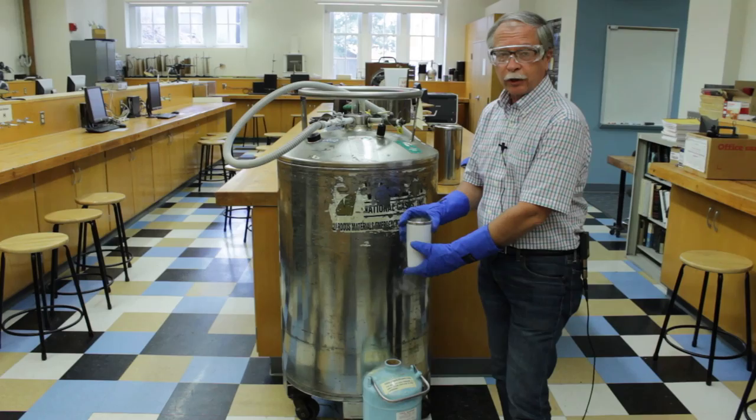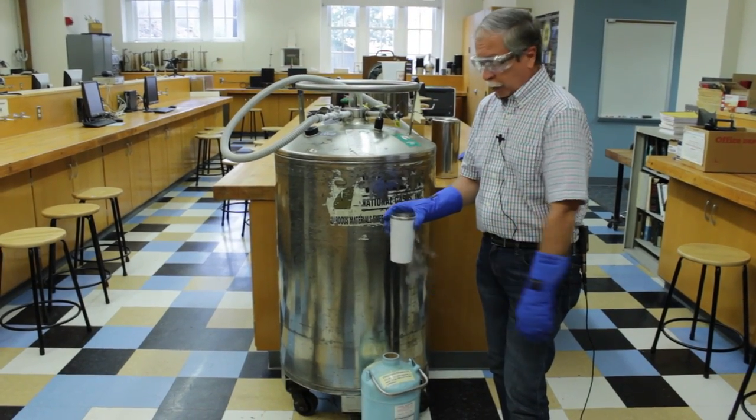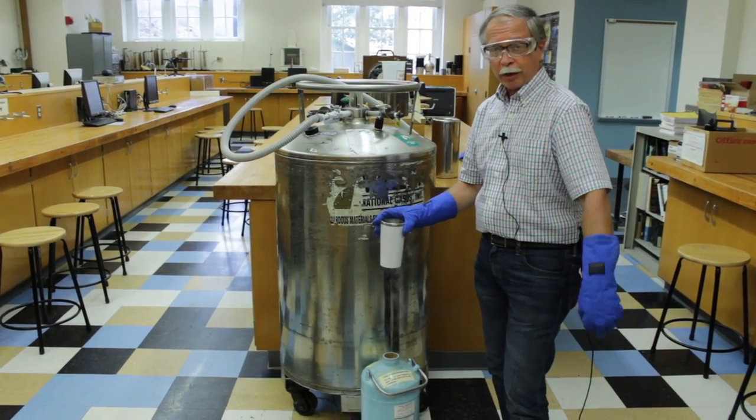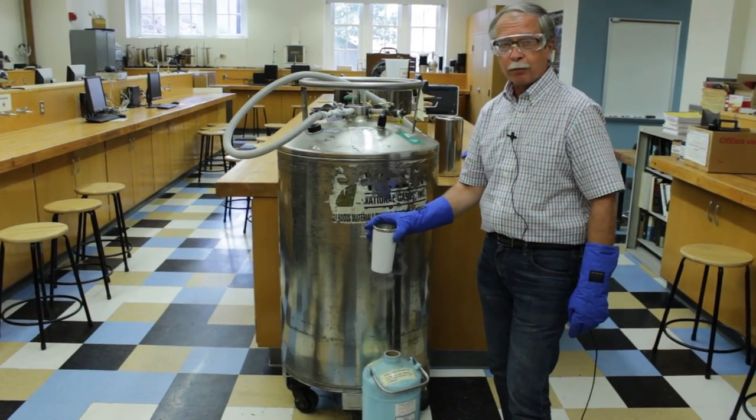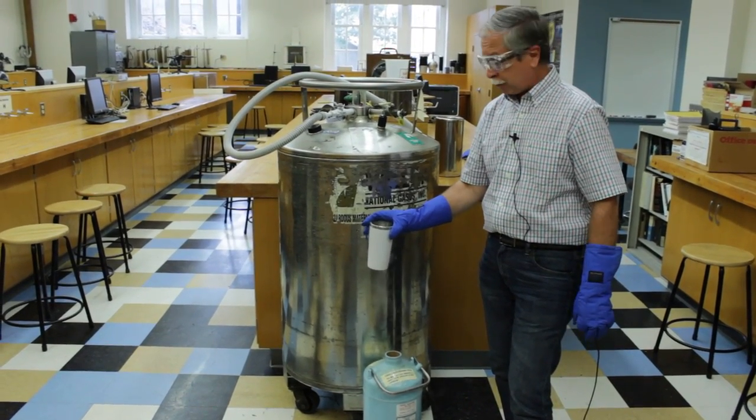When you've finished using your container of liquid nitrogen, you can either pass it to another team who might be a little farther behind or you can have a little bit of fun with it, but I want you to have fun safely.